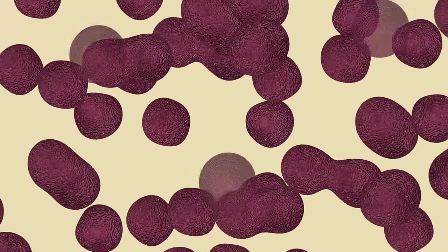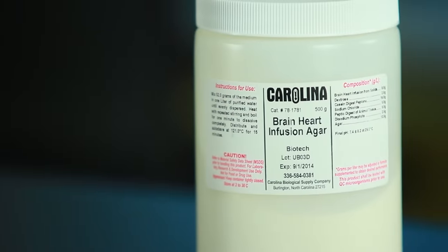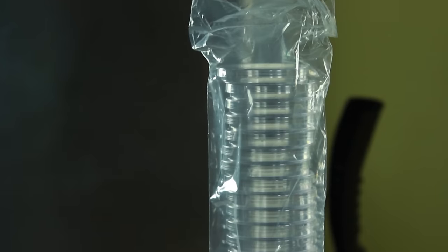When growing cells in the lab, we have to create these conditions using culture media. Solid culture media is a mixture of agar and nutrients poured into petri dishes.